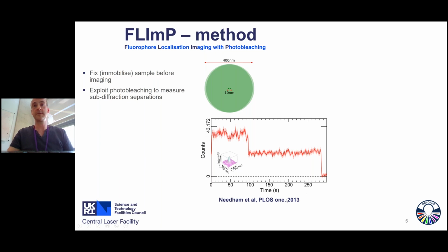So this is now the intensity as a function of time of this single molecule spot, one dot in an image. For examples where we start with 2 fluorophores first, and then 1 photobleaches, followed by the next one, we have this sort of textbook photobleaching example. In this period where only one of the fluorophores is on, we just have the profile of one fluorophore, and so we can fit a Gaussian to that profile. Limited by the number of photons, we can very precisely localize this molecule on its own.